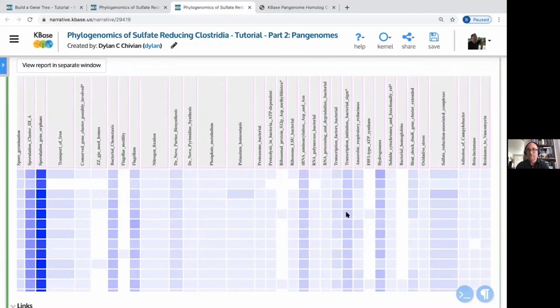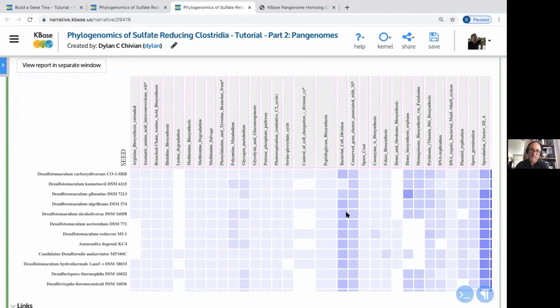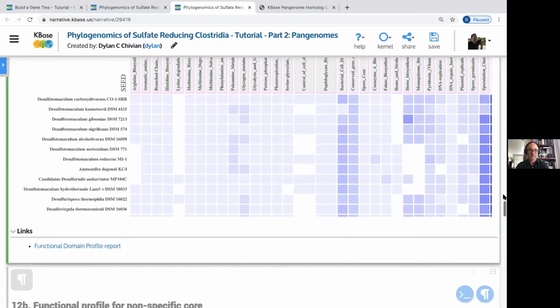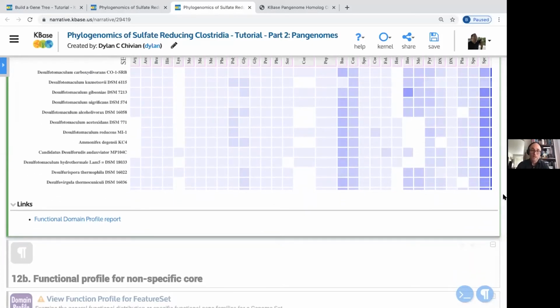And so we've got all of these. Now, again, this is not clustered by functional annotation. It's clustered by sequence homology. And so a lot of this stuff may be a bit distant from E. coli, and therefore some of these may be present in E. coli. It just was distant enough that OrthoMCL did not recognize that sequence homology relationship.